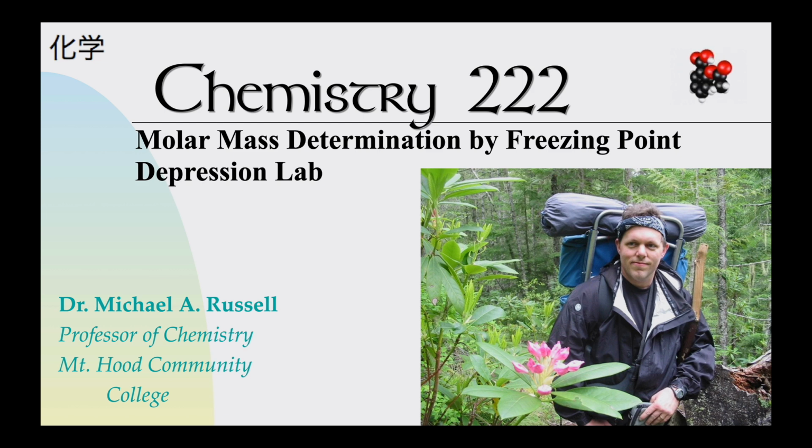We looked earlier at the way to find the molar mass of a volatile liquid. And if your liquid can easily be turned into a gas, that system works really well. But for a lot of compounds, that's just not very reasonable. Either they're too difficult to make boil, or you'd need such extreme temperatures. And sometimes compounds will break down too. So this is another technique that a chemist can use to find the molar mass of a compound.